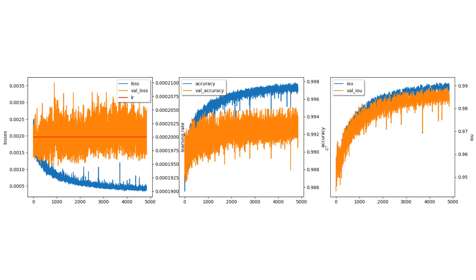Finally, in this example, the plots are very noisy but show a general trend upward for accuracy and IOU. Note that the model got trained for over 4000 epochs. These plots represent training information from a very small dataset of only 12 images and 150 total objects.